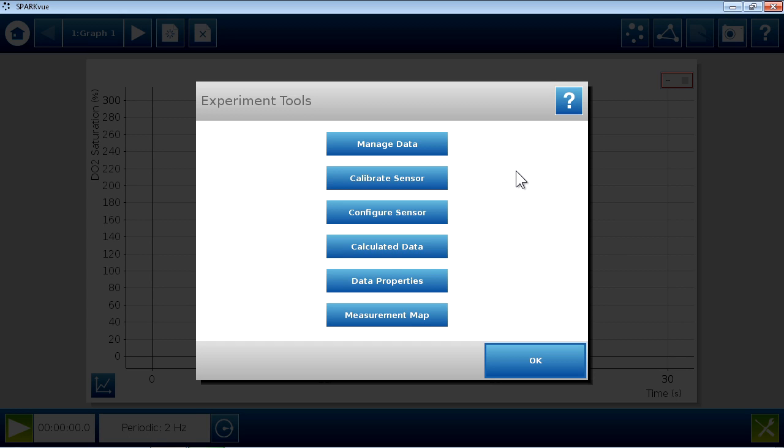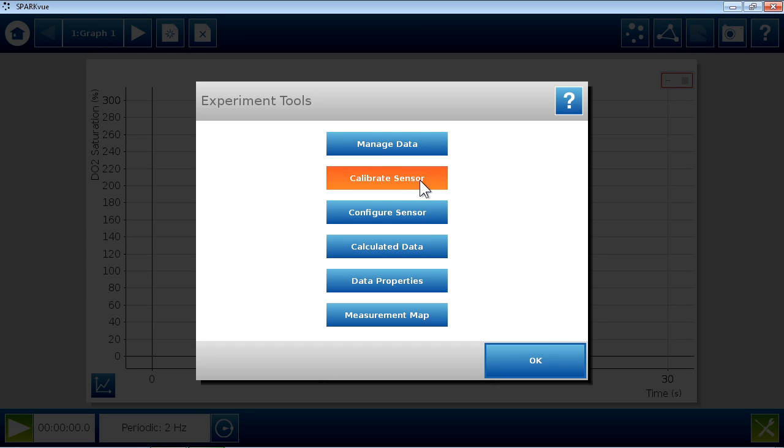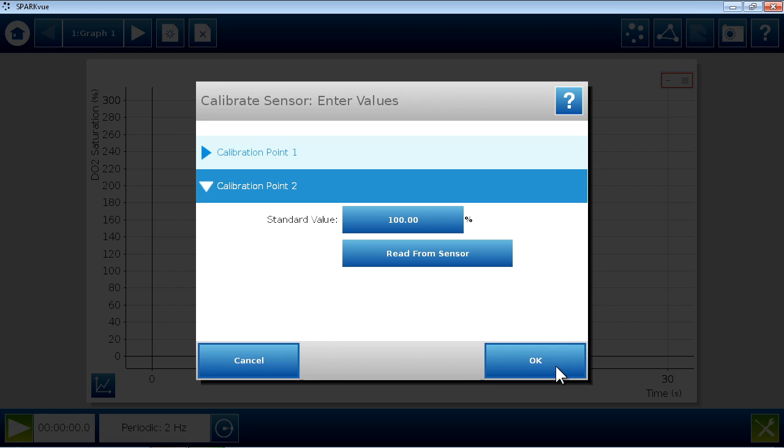To set the salinity constant or to replace a sensor cap, use the Configure Sensor menu. To calibrate the sensor, select Calibrate Sensor. Make sure the Optical Dissolved Oxygen Sensor and Percent Saturation Measurement are selected. Then select Read from Sensor.